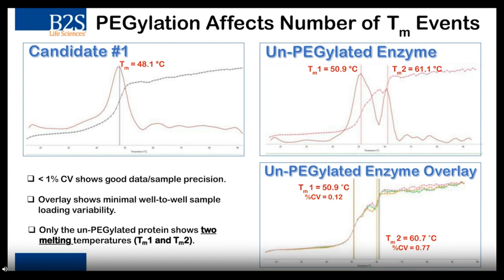So digging a little bit deeper into how the TM experiment works, essentially, once you have your plot of the BCM fluorescence, if you also plot the differential, so the solid red trace in all of these plots, whenever these hit a peak maximum, that defines a phase change or melting point in this experiment.